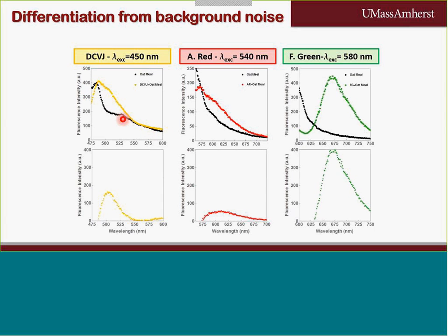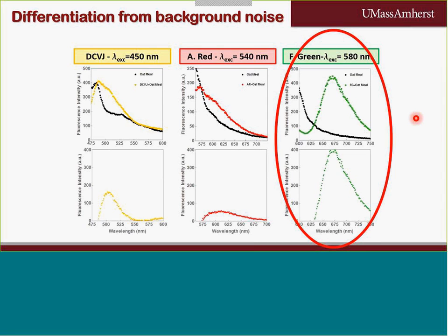In the case of one unconventional molecular rotor, it was very difficult to obtain this differentiation, but when we went for the probe we thought in our preliminary tests was going to perform better, it actually did.